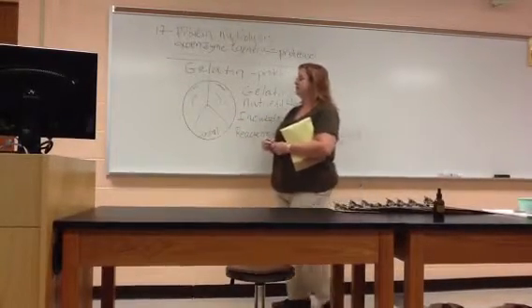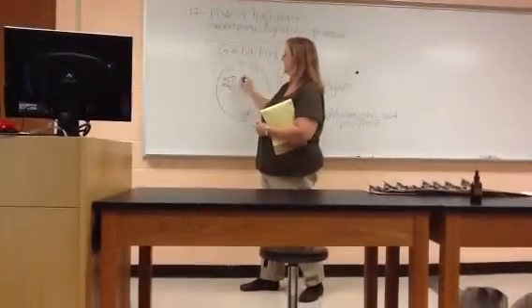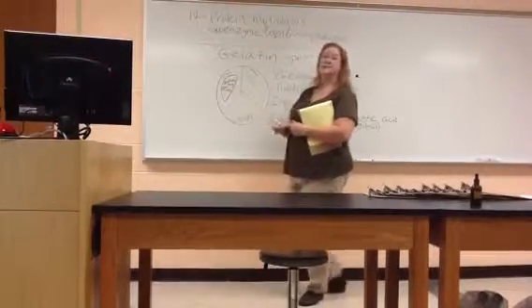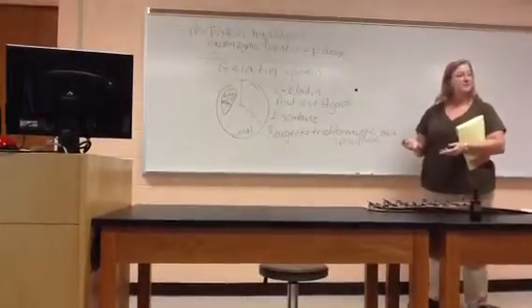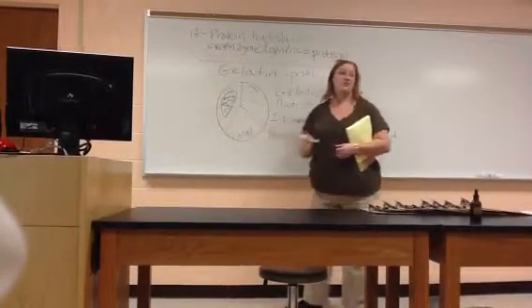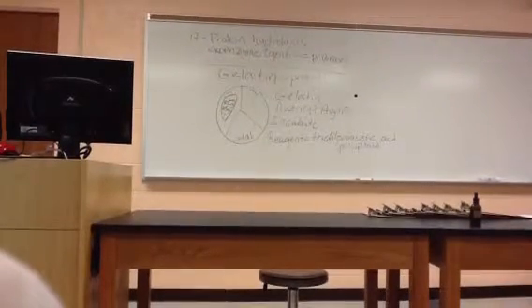All right, so if this was the positive bacteria, and it's releasing the exoenzyme, what's going to happen to all of the gelatin around it? It's going to be broken down by the exoenzyme. So when we add the trichloroacetic acid, is it going to clump? No. We're going to have an area around the bacterial growth that has no white color. That's your positive result. No white color around the bacterial growth.